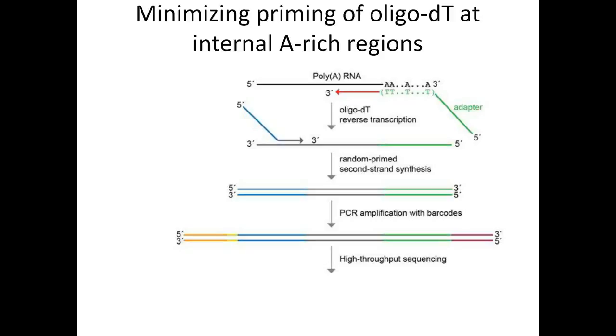All right. Lots of great questions coming in from our attendees today. Compared to full-length RNA sequencing, how much less sequencing was performed for 3'?